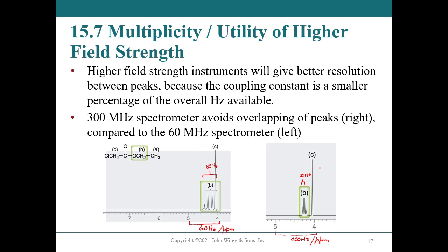The one we have here in the chemistry department is a 400 megahertz, a 9.4 Tesla magnet. It's actually sort of low to mid-range these days. You can buy 600, 800, even gigahertz spectrometers. I think they've made a 1200 megahertz spectrometer now, but they're huge and expensive, and the companies making them still have difficulty getting those to work stably.